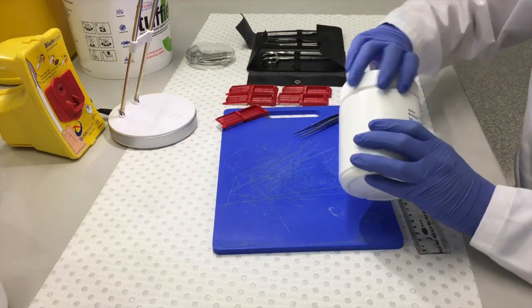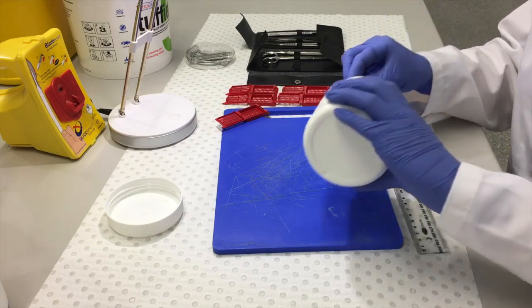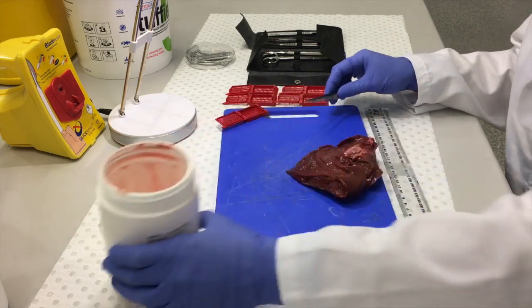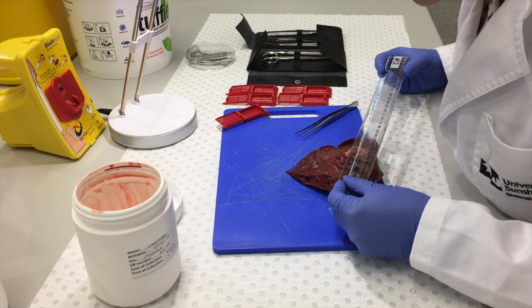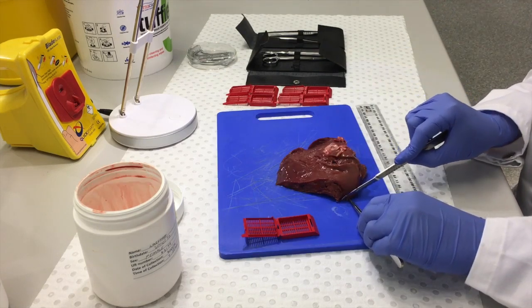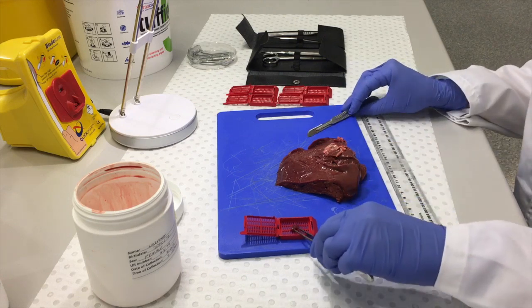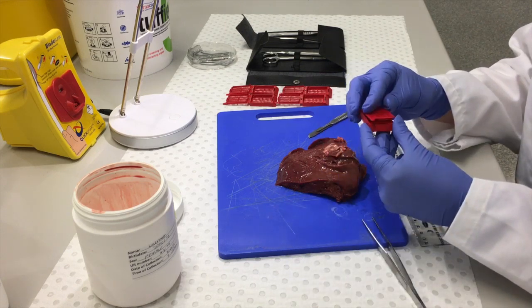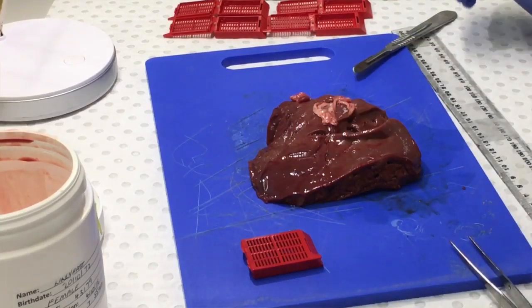After the specimen has been accessioned, the pathologist or the scientist conducts a gross examination, whereby the tissue is described and measured, and all or some of the tissue is prepared for tissue processing. Some of the tissue is removed from the organ and it is placed into a cassette. The cassette is able to hold the tissue in place while tissue processing occurs. The cassette is also used in the embedding process, which we will look at later on.